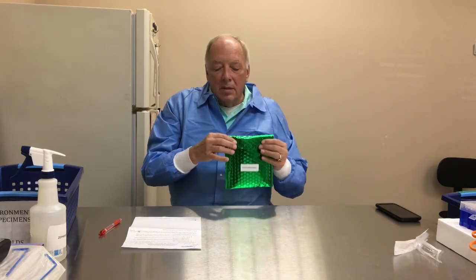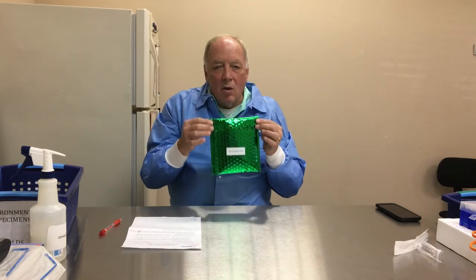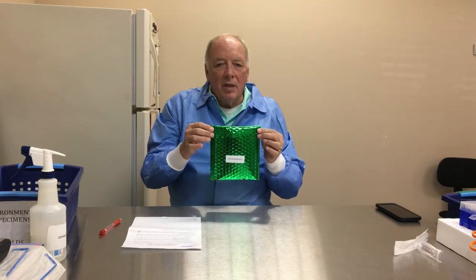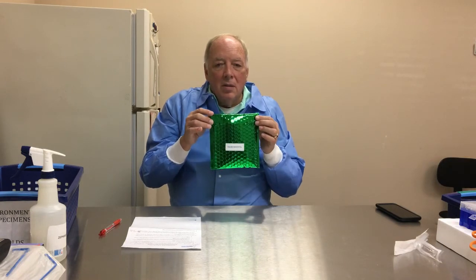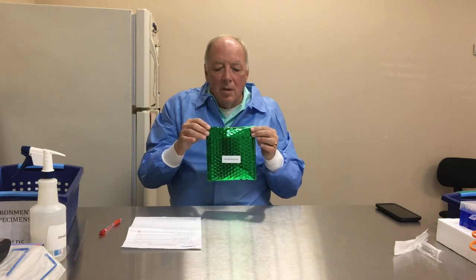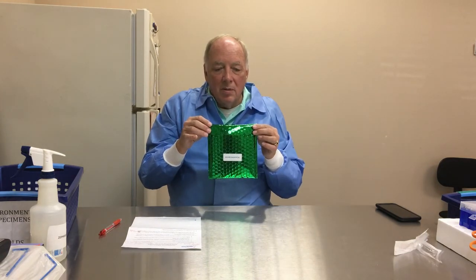In summary, this whole procedure has been to look at the environmental kit and explain how to collect samples and fill out the forms. Thank you.